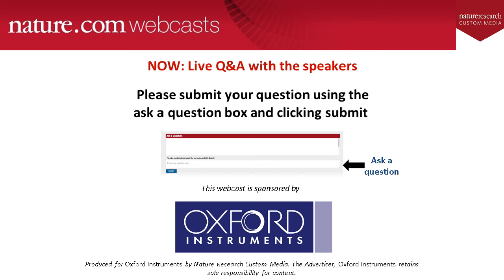On the systems I've looked at, it's been around 10 millimetres, which isn't the same as the working distance between the sample and the Extreme detector, as that sits just slightly below the pole piece, so that's a smaller working distance.